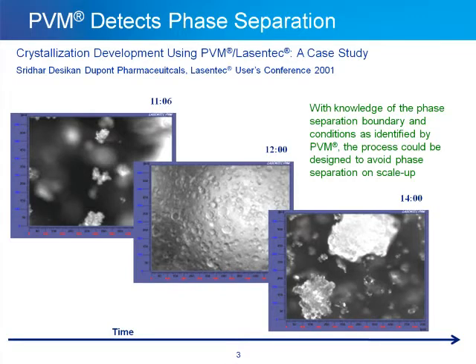And again, what we call oiling out in the crystallization industry, there's a droplet phase formation where there's an immiscible phase. Those droplets can cause problems with downstream processing. Certainly, those droplets can cause impurity concerns or flow property concerns or other downstream processing issues. And as you see, PVM was able to detect the point at which those droplets formed.